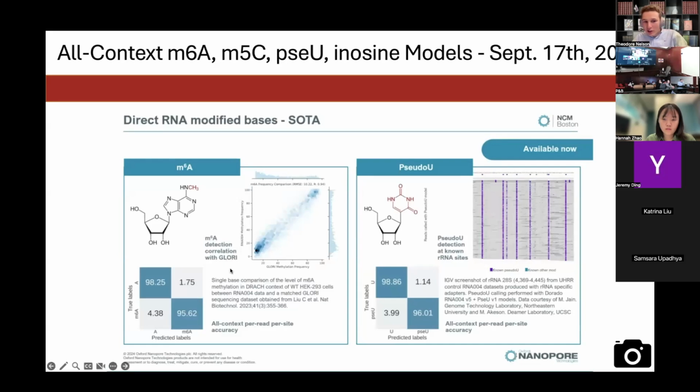And I can show you here that Nanopore has these specific claimed accuracies for how often they miscall A's or m6A's, the false negative, the false positive rate. The way that they do these calculations are on a single molecule level. So molecule by molecule, and they know, on that specific molecule, in that specific place, in that specific point, they have synthesized an m6A.